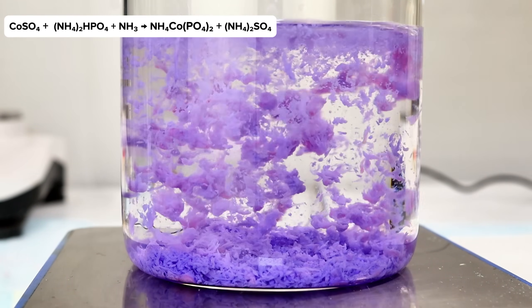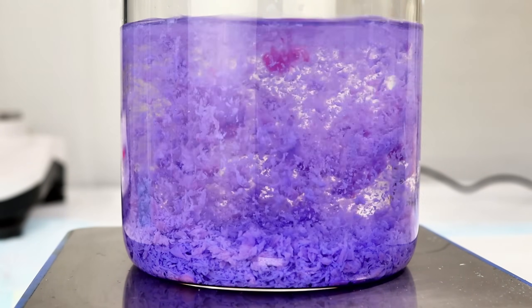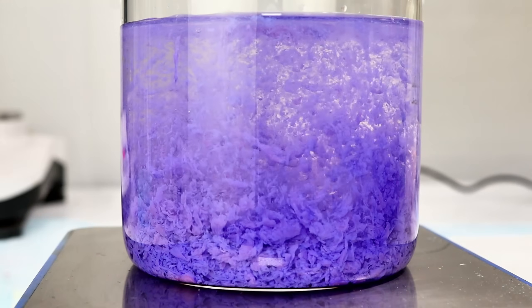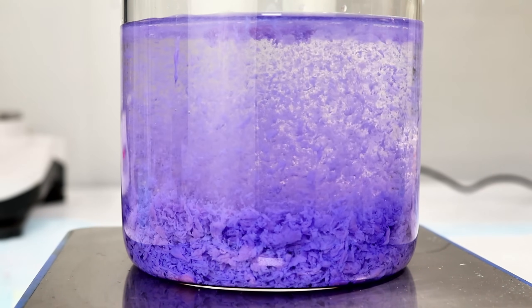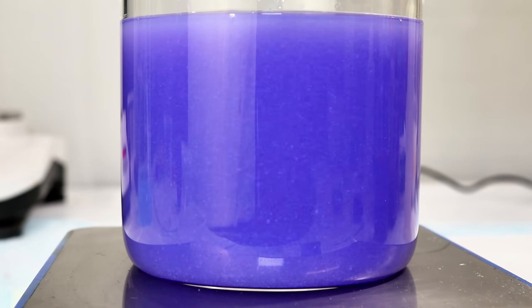Without any mixing, the solid immediately forms as these little purple blobs that quickly sink to the bottom of the beaker. You'll notice here that at first the precipitate is a very cool purple, and that as I continue to add cobalt sulfate, it gradually begins to redshift.